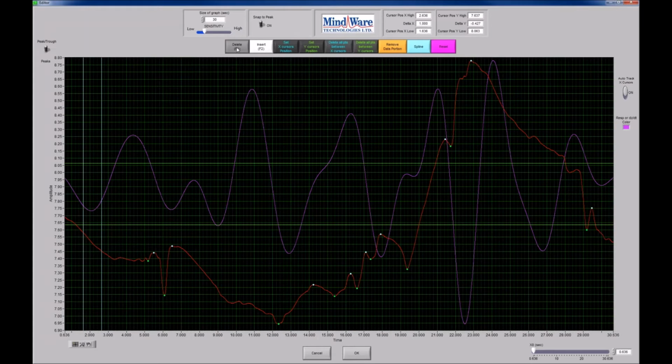So we want to make sure when we're editing our EDA signal in here that we're always leaving with a pair of those, with equal number troughs and peaks defined on our waveform. And if we don't, we will get an error, and I'll show you that as well. But for the time being, we're going to really pay attention to the fact that we're deleting one trough and one peak always. We're never deleting just one or the other.